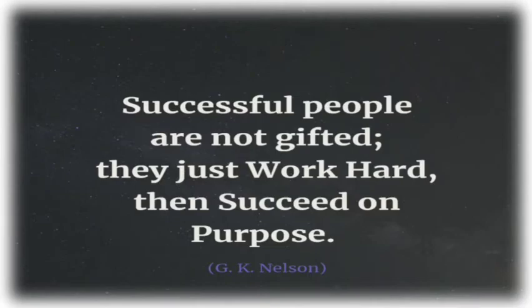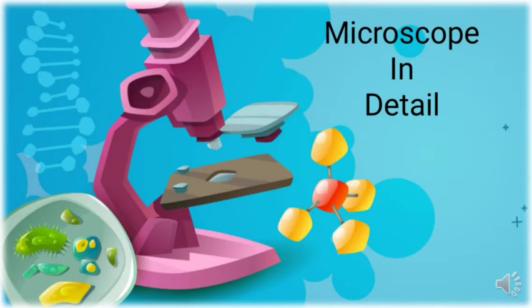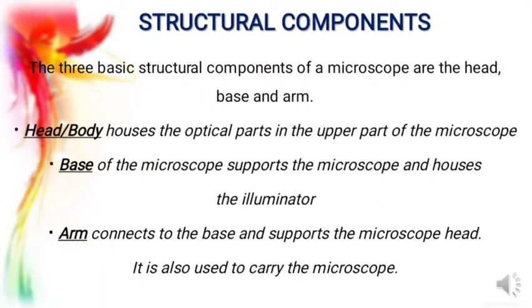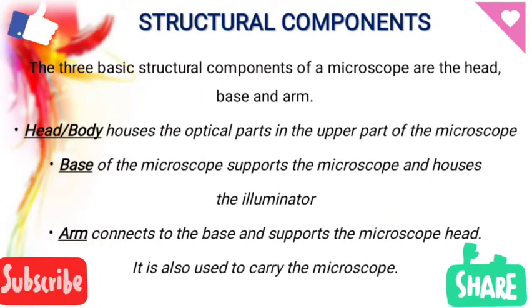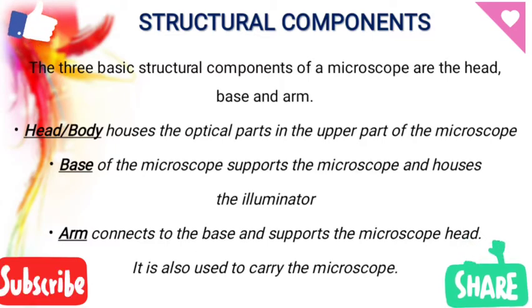Today's topic: microscope. Let's study the microscope in more detail. The structural components of the microscope. There are three basic structural components of a microscope, and they are head, base, and arm.